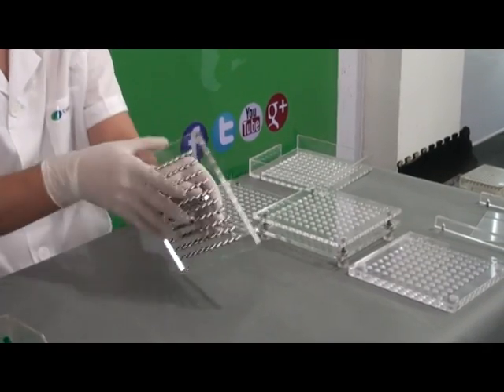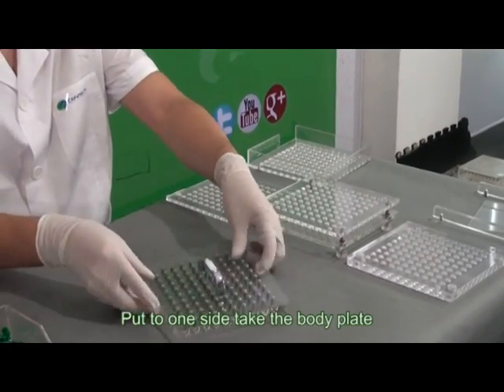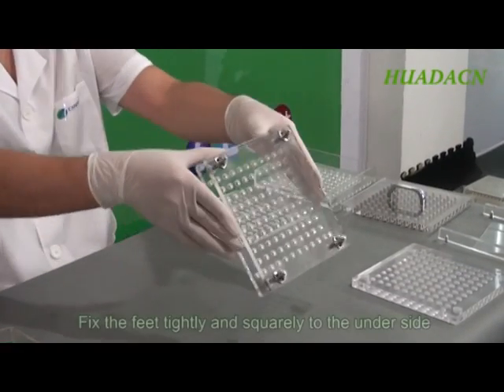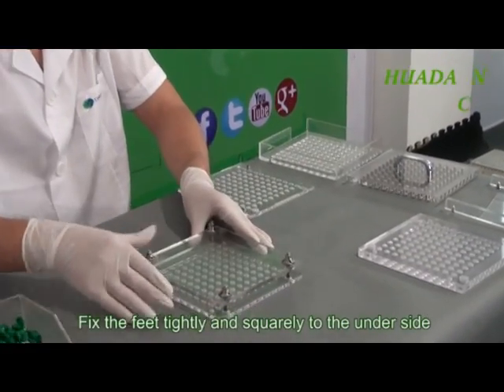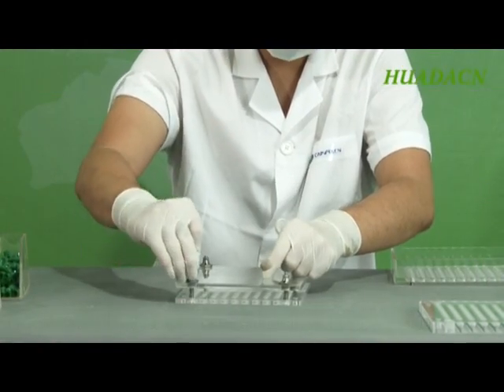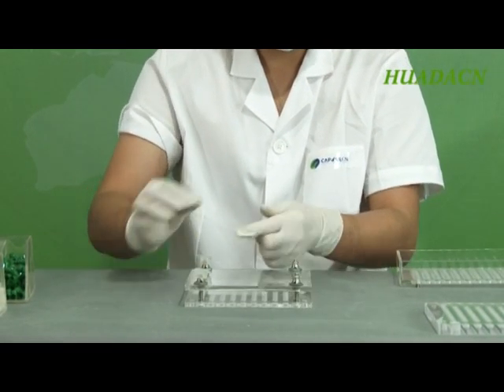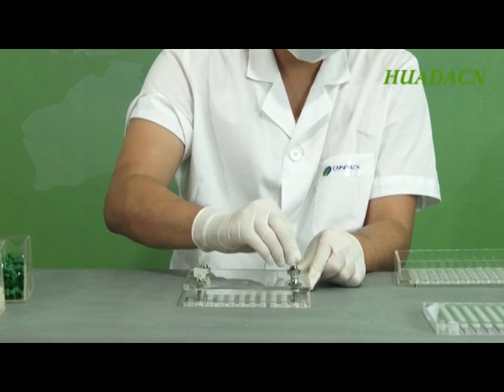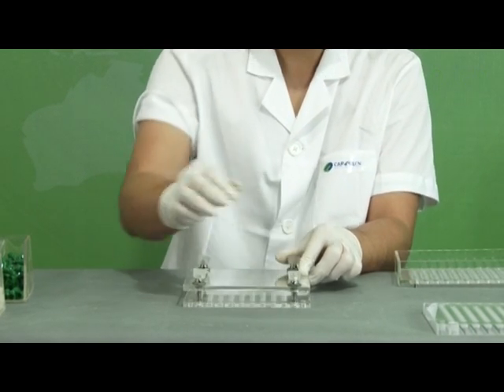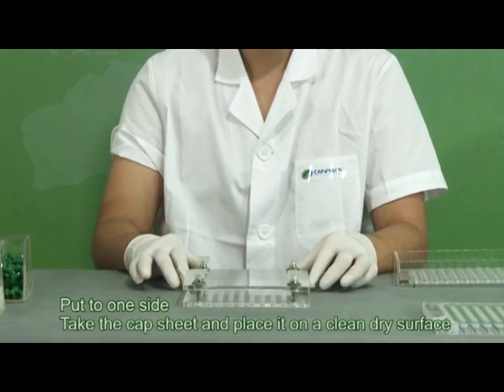Take the bodyplate and fix the feet tightly and squarely to the underside. Put to one side.